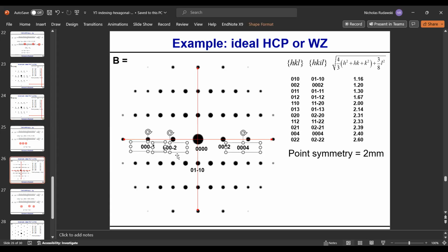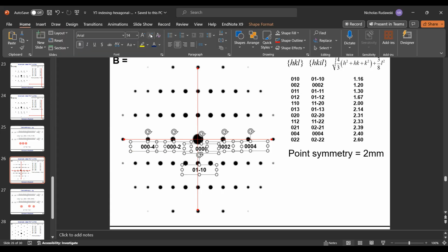Just to make this a little quicker. Now, this was one of the ones, I remember this now, where I had to reduce the font size down. I remember I had to make this 10 in order for this to work. Yeah, that should work okay.